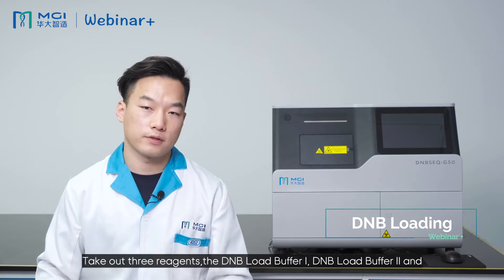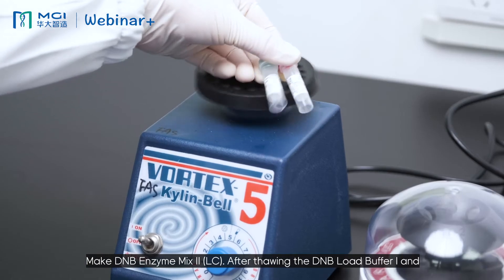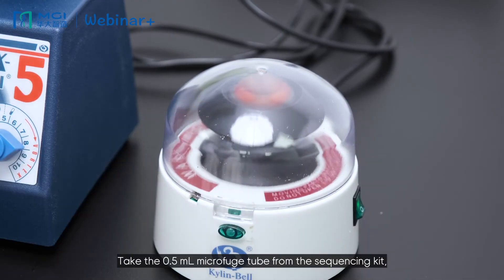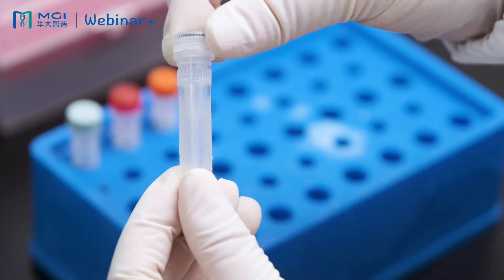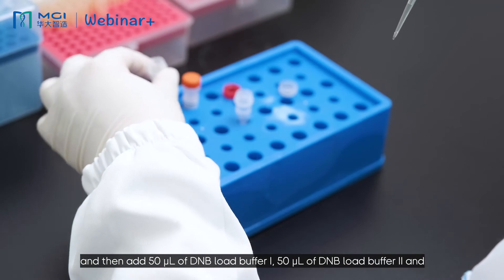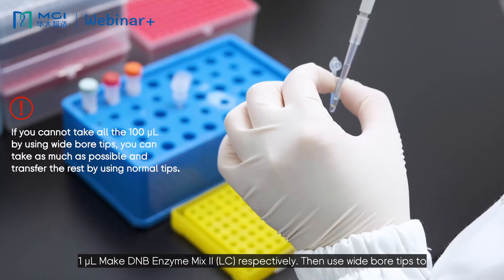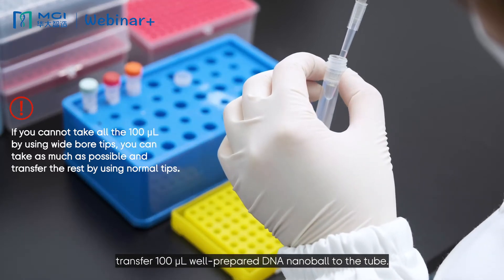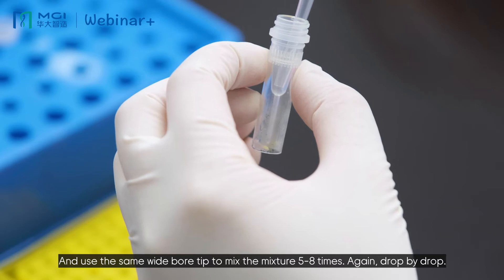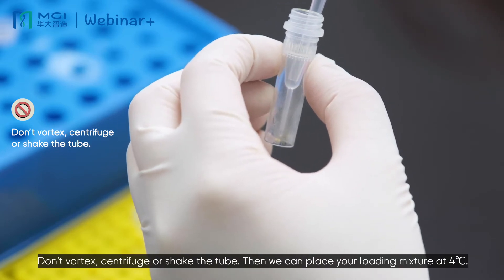Take three reagents: DNB load buffer 1, DNB load buffer 2, and MgI-DNB enzyme mix 2-LC. After thawing the DNB load buffer 1 and DNB load buffer 2, vortex them and short-spin. Take a 0.5 ml microfuge tube from the sequencing kit, then add 50 microliters of DNB load buffer 1, 50 microliters of DNB load buffer 2, and 1 microliter of MgI-DNB enzyme mix 2-LC respectively. Then use wide-bore tips to transfer 100 microliters of well-prepared DNB to the tube and mix 5 to 8 times. Remember: drop by drop — don't vortex, centrifuge, or shake the tube.